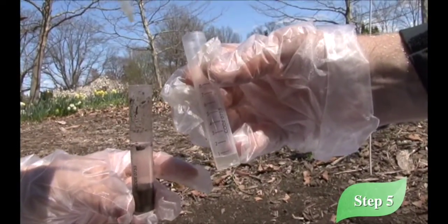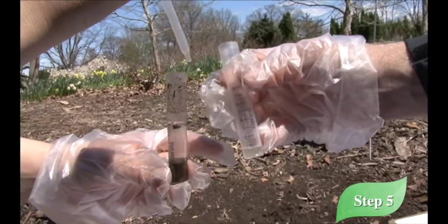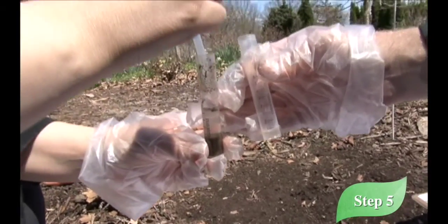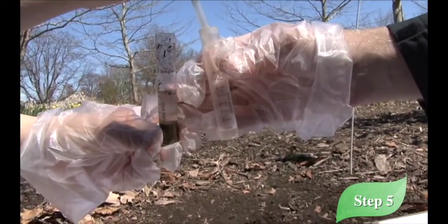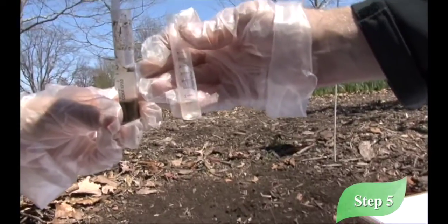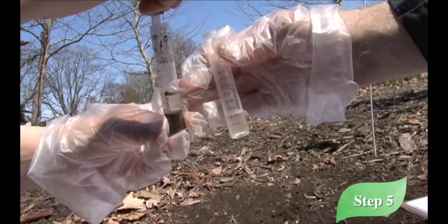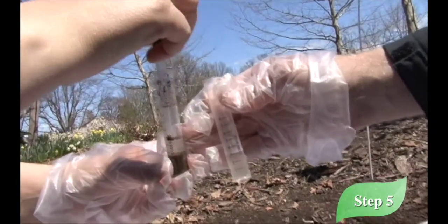Now, we're going to separate the liquid from the test tube by, again, squeezing the bulb so we're not agitating the soil. Put it into the solution, but not too close to the soil. Release the bulb slowly, drawing the clear liquid into the pipette. And we want to make sure we pull no soil into it. We're filling the second test tube to line 5, which is 5 milliliters. We have to do that a few times. Again, squeeze, slowly lift, squeeze, slowly lift, squeeze, slowly lift.